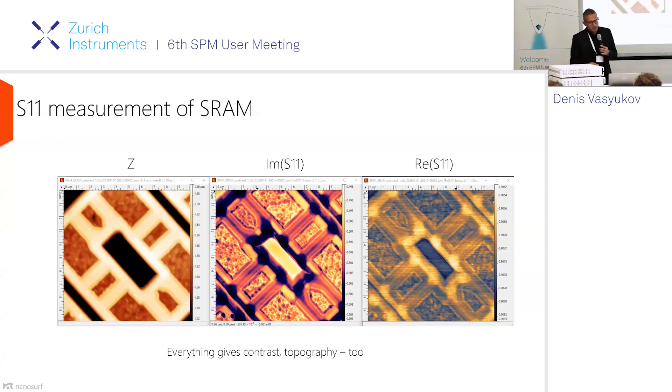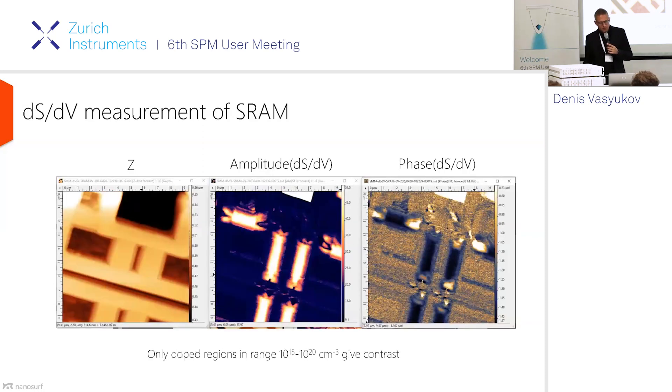Another sample we often measure is the memory sample — an SRAM. This is a very typical sample for microwave measurements because it really shows what information you can get. The dark lines you can see are the conducting channels inside silicon. These channels are subsurface — you cannot see them in the topography image on the left; they are buried under some silicon oxide. You also see that in principle everything gives contrast: the grainy area is polysilicon, and the difference in height also creates contrast. So if you are doing measurements that require calibration, you should polish your sample to minimize topography.